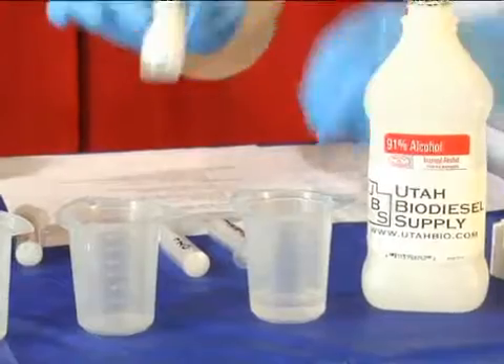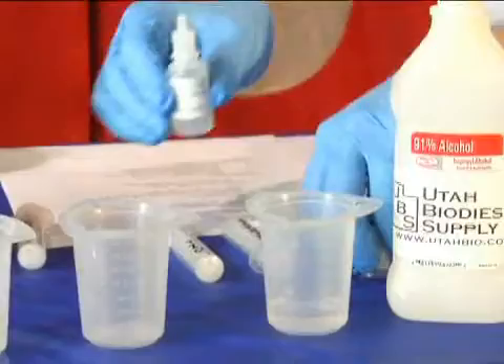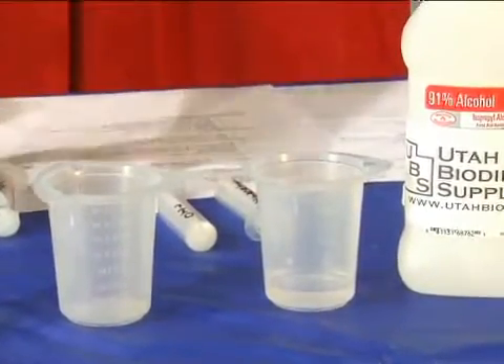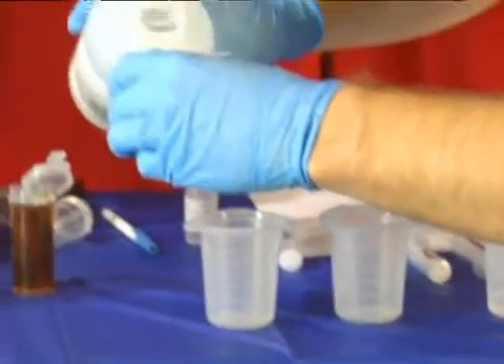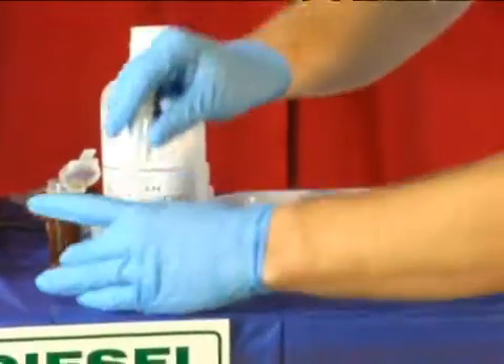We're then going to take a couple drops of phenolphthalein and put it in there. We're then going to use some of our titrating solution — I'm going to put a little bit of that in a cup over here and suck some up with a separate syringe.